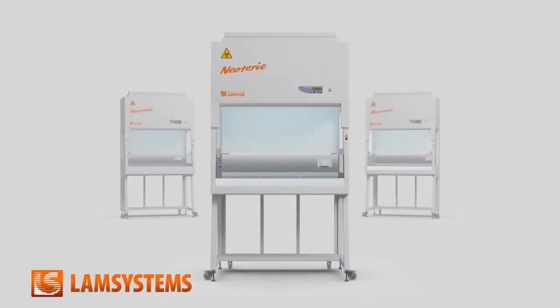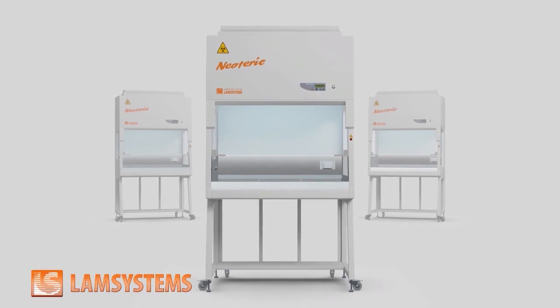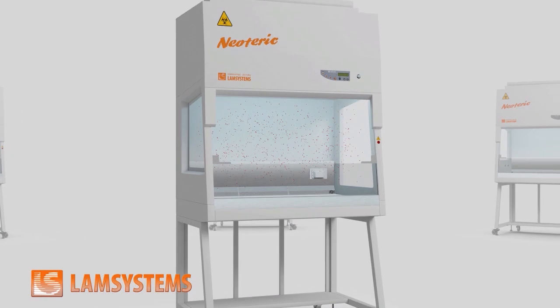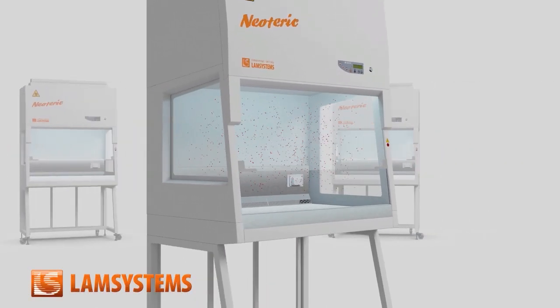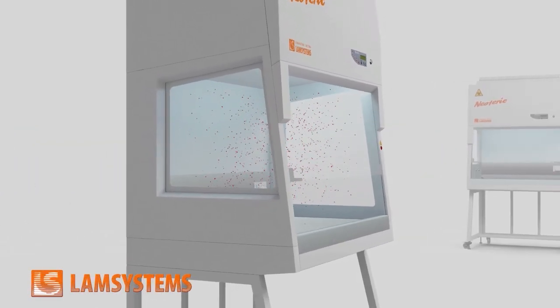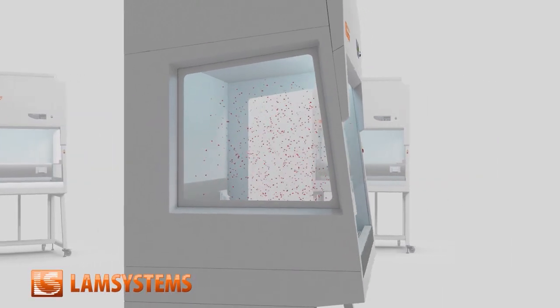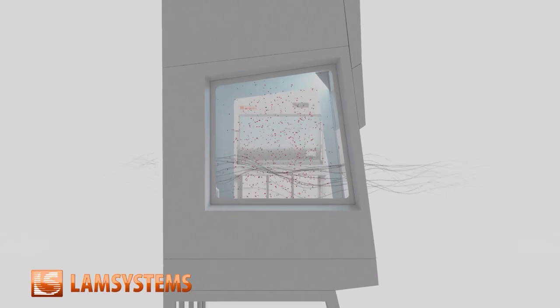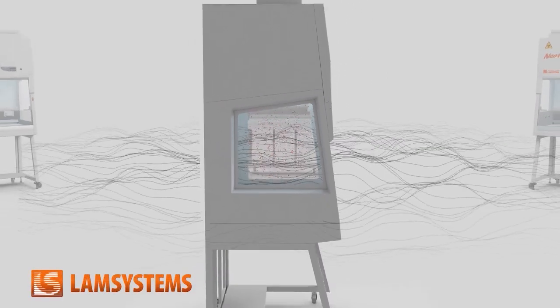The second-class biosafety cabinets provide personnel, product, and environment protection inherent in work with airborne pathogenic agents and microorganisms. Microorganisms cannot move themselves. But if they join a dust or moist particle, they can move in the air, threatening to contaminate all living beings on Earth.